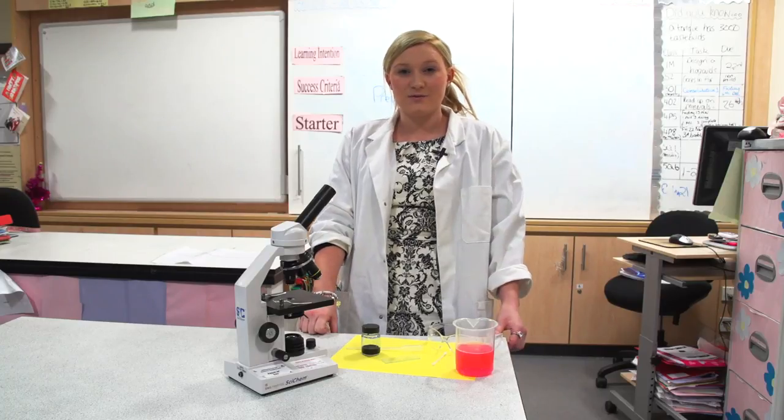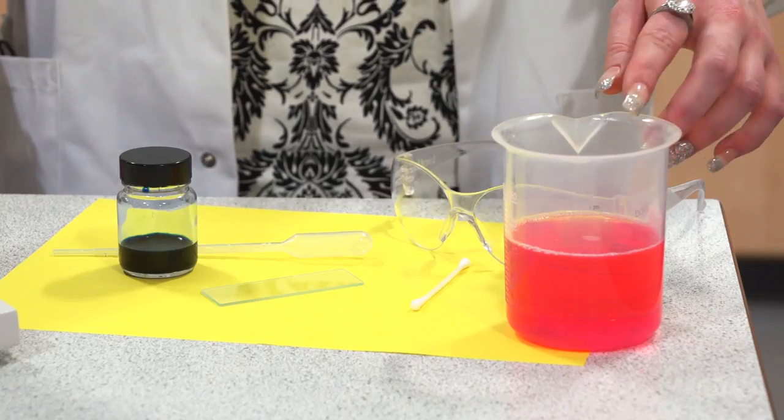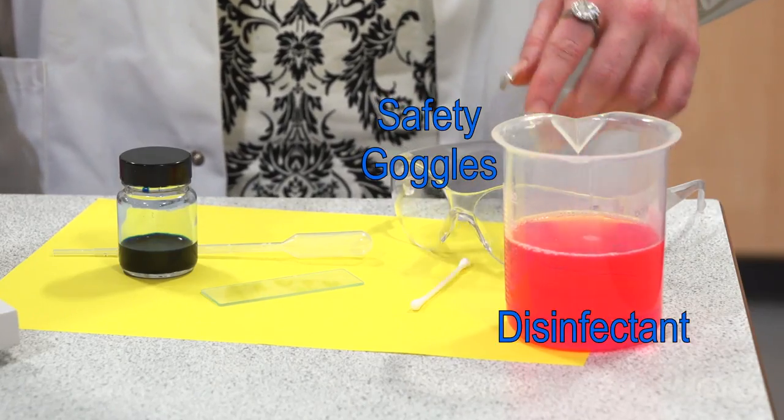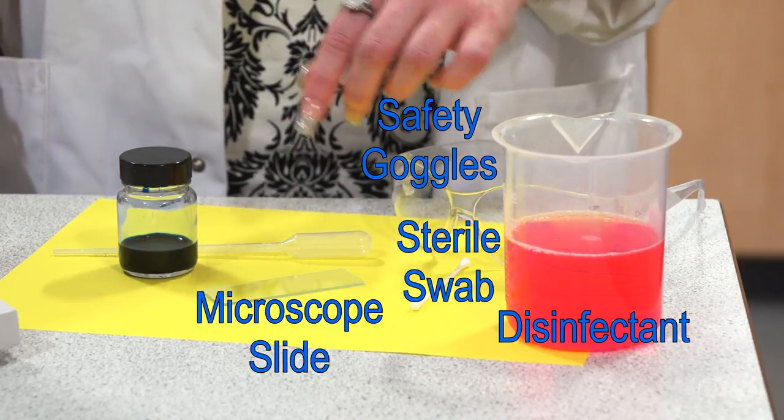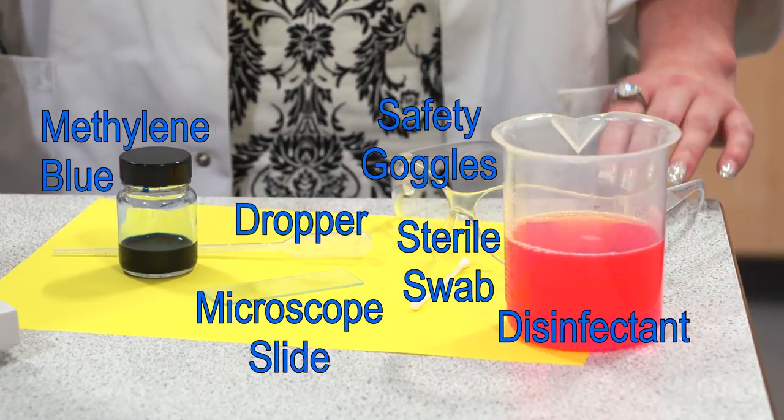To prepare a cheek cell slide you'll need the following apparatus: a beaker of disinfectant, safety goggles, a sterile swab, a microscope slide which is made of glass and has sharp corners, a dropper, and methylene blue dye.